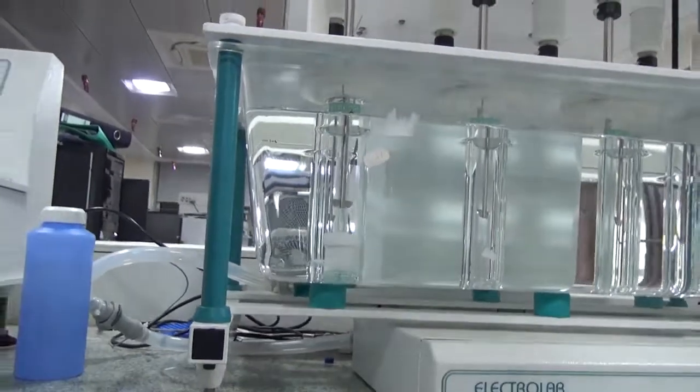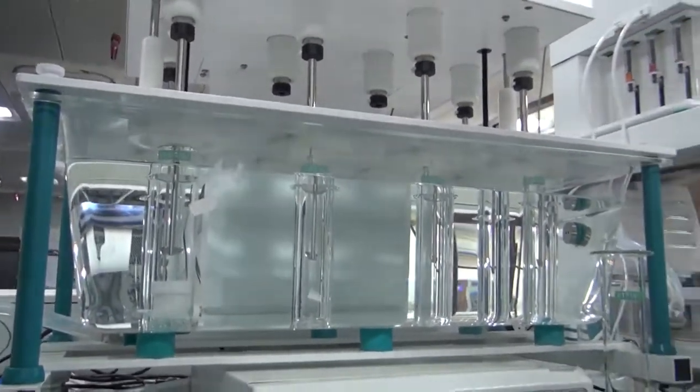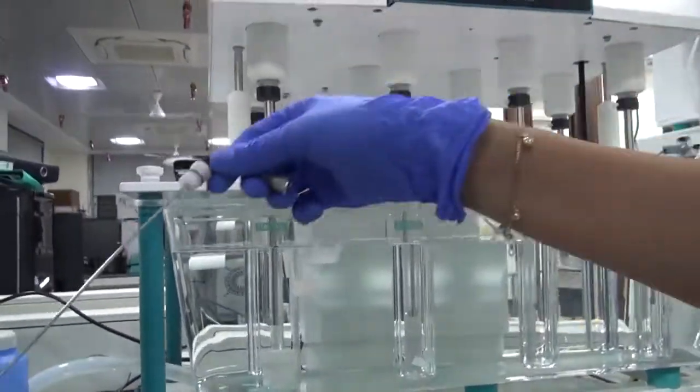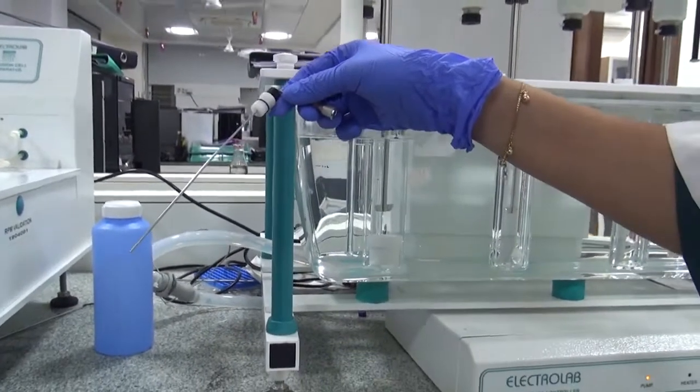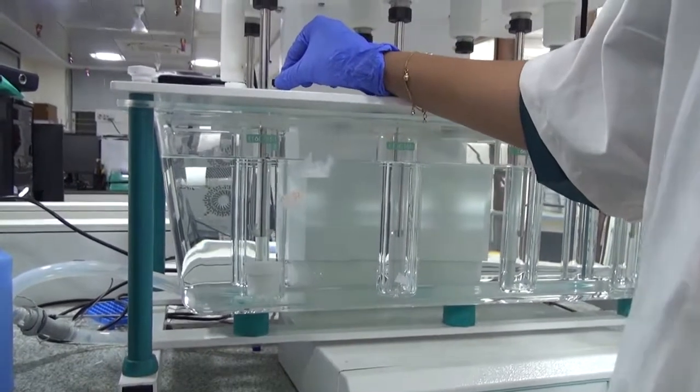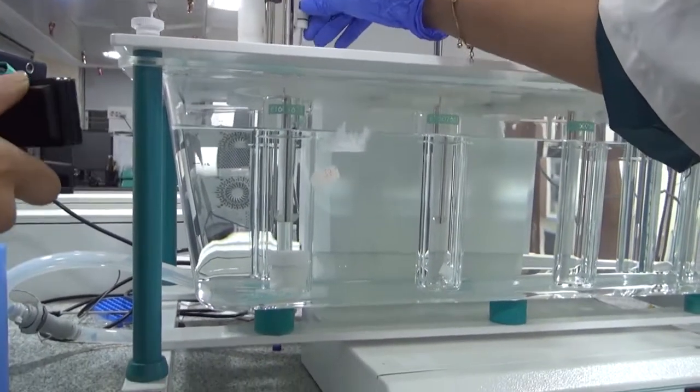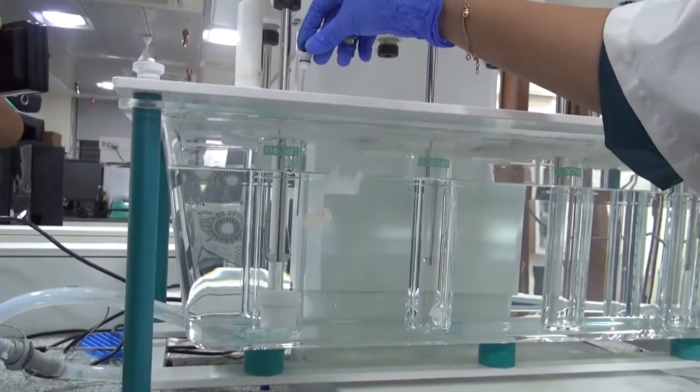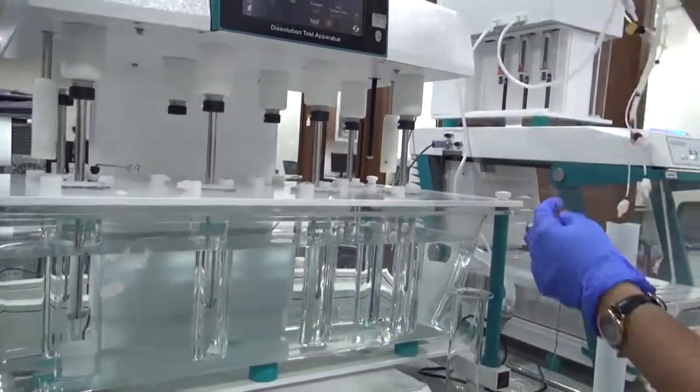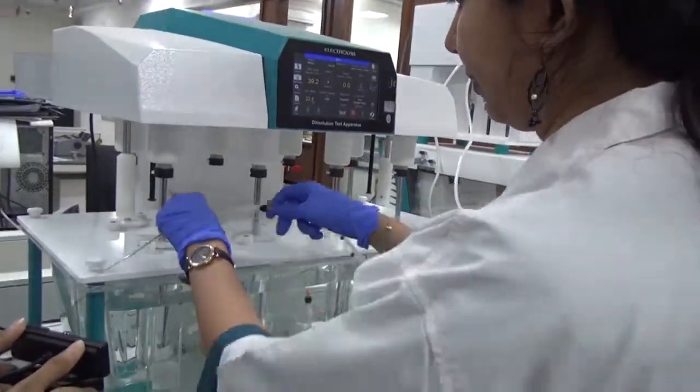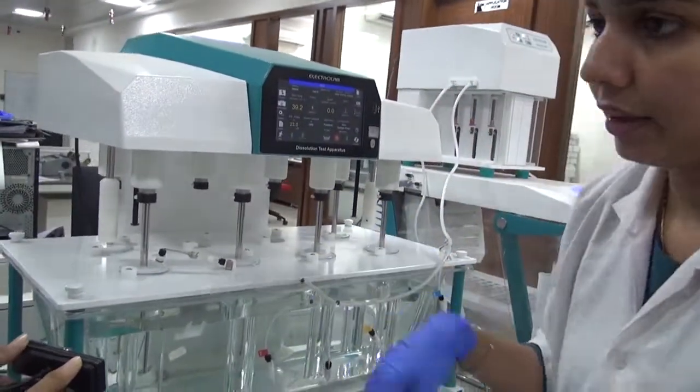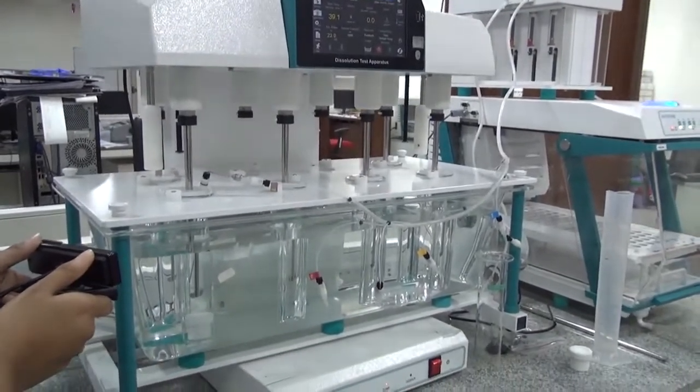This is the cannula that we have for sampling from the immersion cell vessel. This cannula will go in and rest at the sampling zone. The height can be adjusted for this cannula, and it can be connected to the syringe pump and sample collector, which ensures we get automatic sampling.